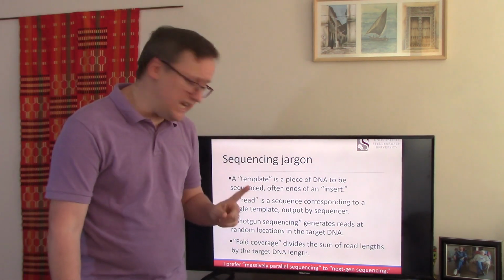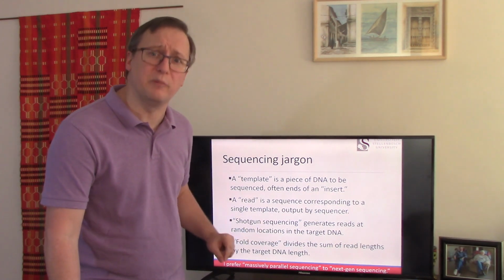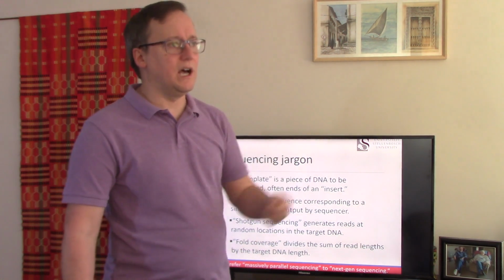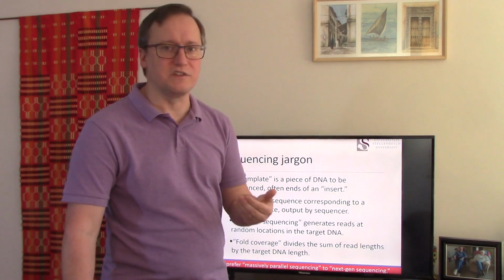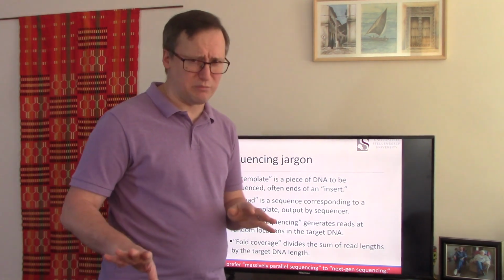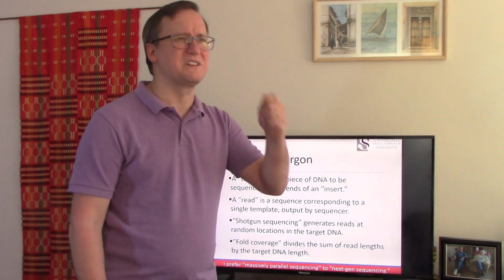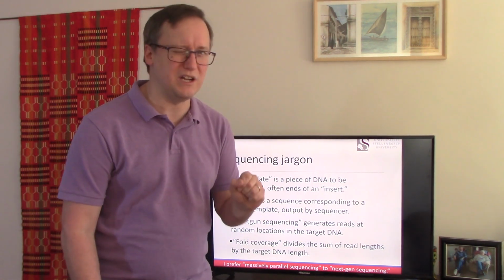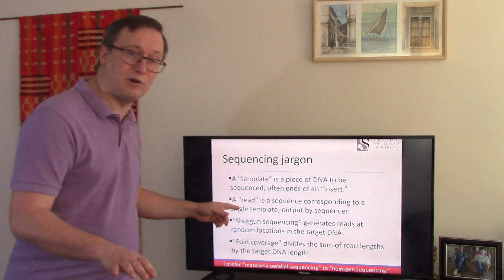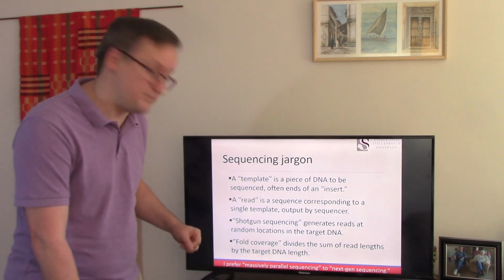Okay, a read is the sequence corresponding to a single template, but it is the output from the sequencer. So a read may give us high quality sequences throughout, and all of those base calls might be absolutely bulletproof, or they might be quite error prone. So we should be careful when we say that a read is the sequence complementary to a template. Well, maybe not. Maybe the sequencer made some errors along the way. So it's kind of a potentially error prone stretch of sequence letters that represent the complement to the template sequence.